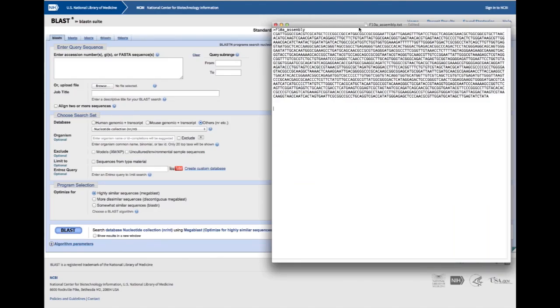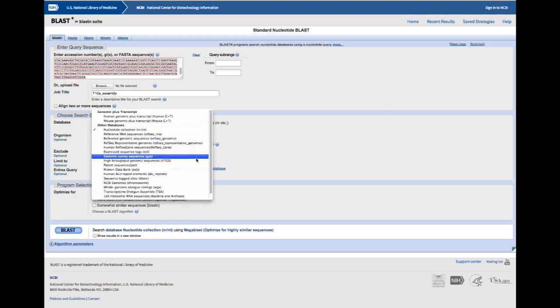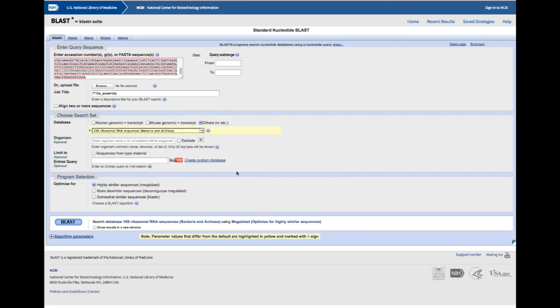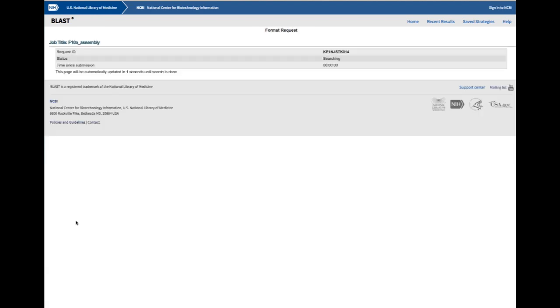The entry page is set up to easily allow us to perform a standard nucleotide BLAST. I'm now copying our sequence in plain text or FASTA format and pasting it into the query box. I'm going to select the database to query from this list — that would be a database of all known 16S ribosomal RNA sequences from bacteria and archaea. The default parameters for the program and the algorithm are correct for us, but if we wanted to change them, we could. We should record all the settings we are using in your notebook.